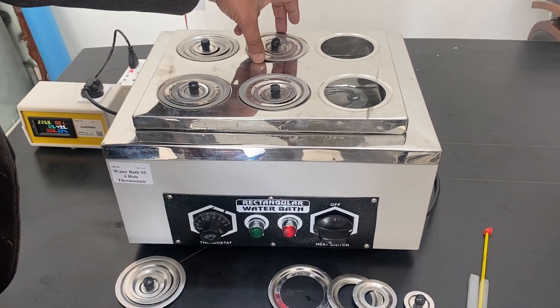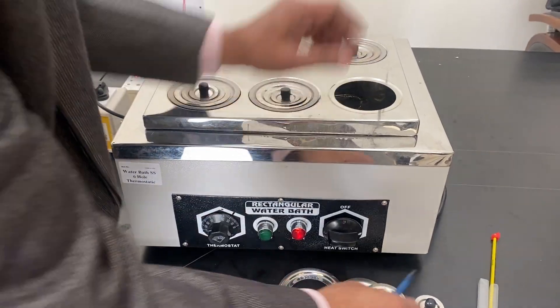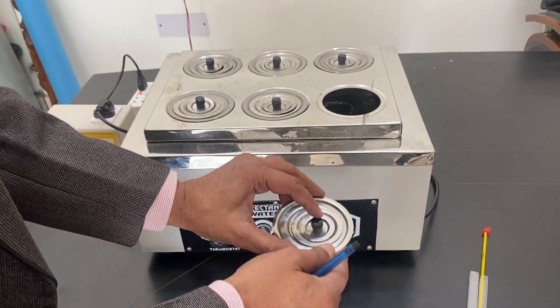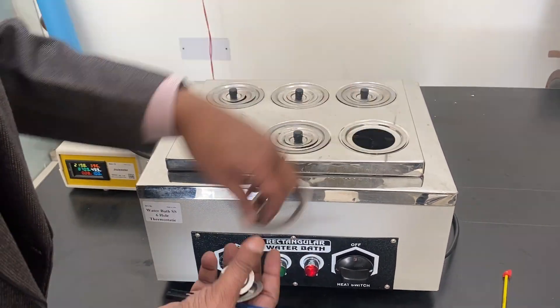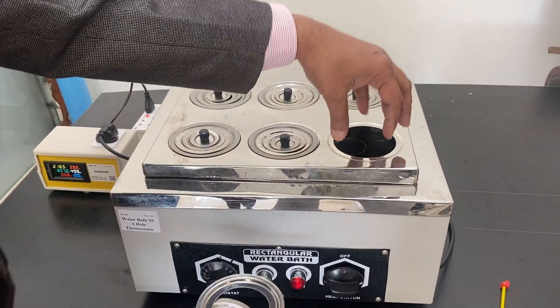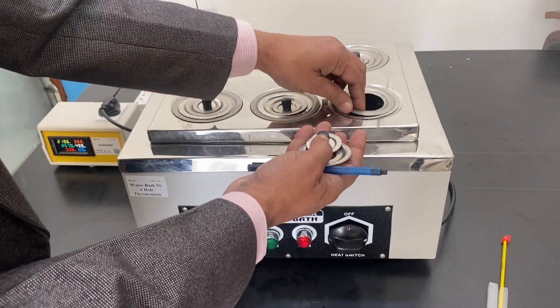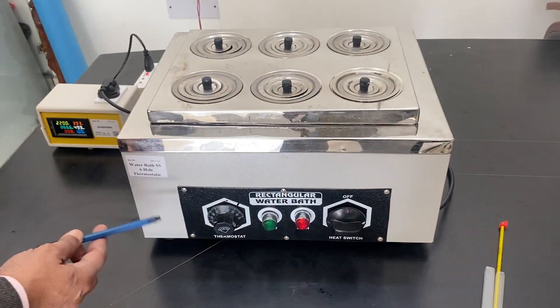You can use a test tube, small beaker, or similarly different products — they can be heated. Mostly it is used up to 70 or 80 degrees. You can open this part and hang a beaker of this size, or you can remove this and put the beaker here also. It is very easy. Mostly this is used for test tubes or beakers — very easy to use.